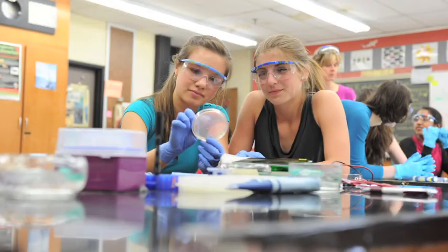So the white colony may not have the RFP gene however the pink colony should have the RFP gene and this will be visible after PCR when you visualize your products with gel electrophoresis.